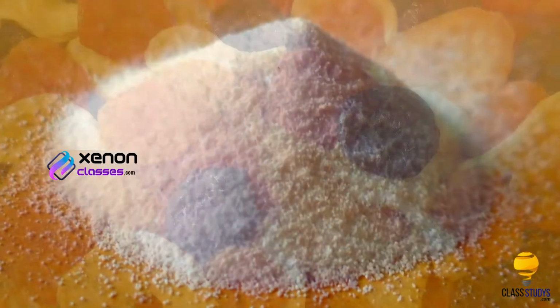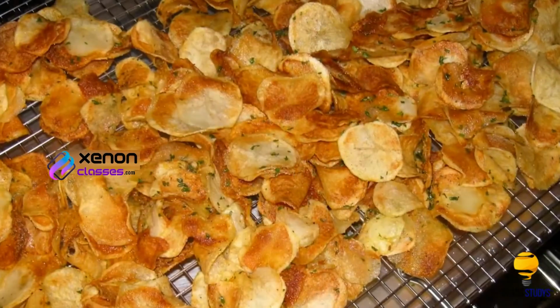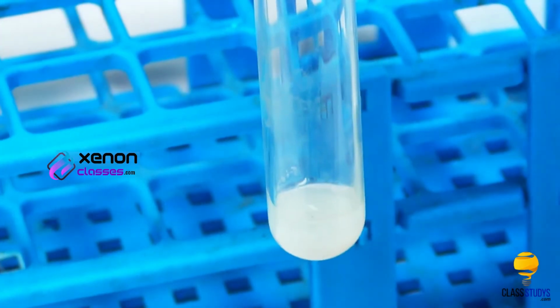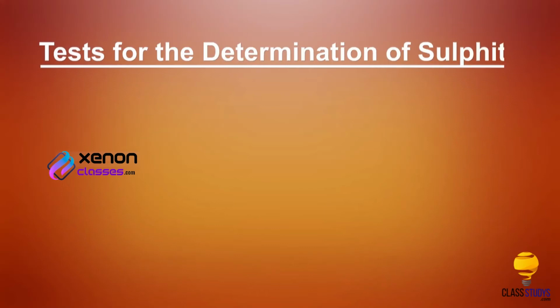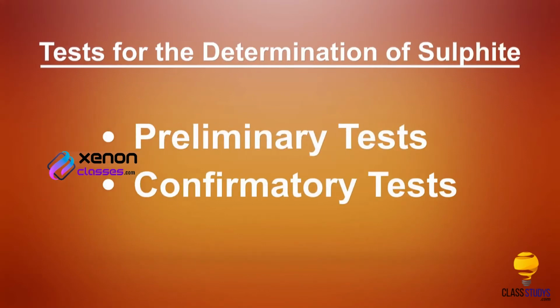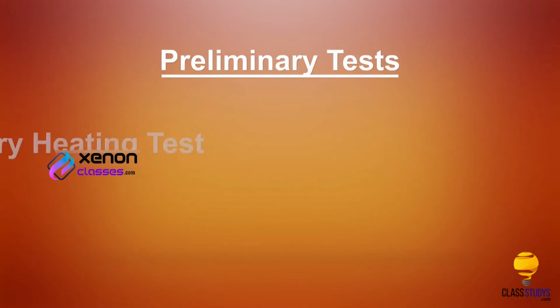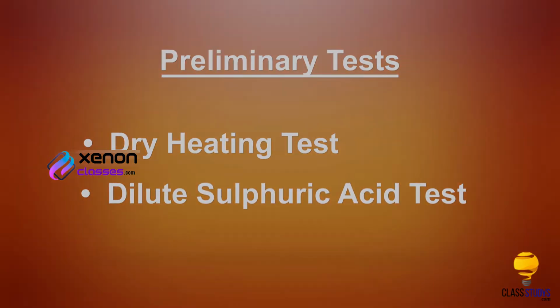Sulphites are often used as preservatives in dried fruits, preserved radish, and dried potato products. Our aim here is to test the presence of sulphite ion in a given salt. The tests to determine the presence of sulphite ion are preliminary tests and confirmatory tests. The preliminary tests are dry heating test and dilute sulfuric acid test.